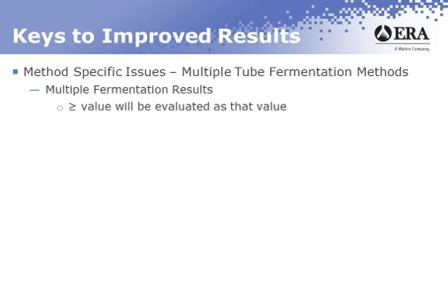If you recall, the manufacturing range that PT providers are required to use is 20 to 2400. You're basically using a method that doesn't cover the entire manufacturing range. So if you're analyzing a PT that happens to be in the higher portion of the range, you may have cut yourself short. You basically aren't covering the entire range.